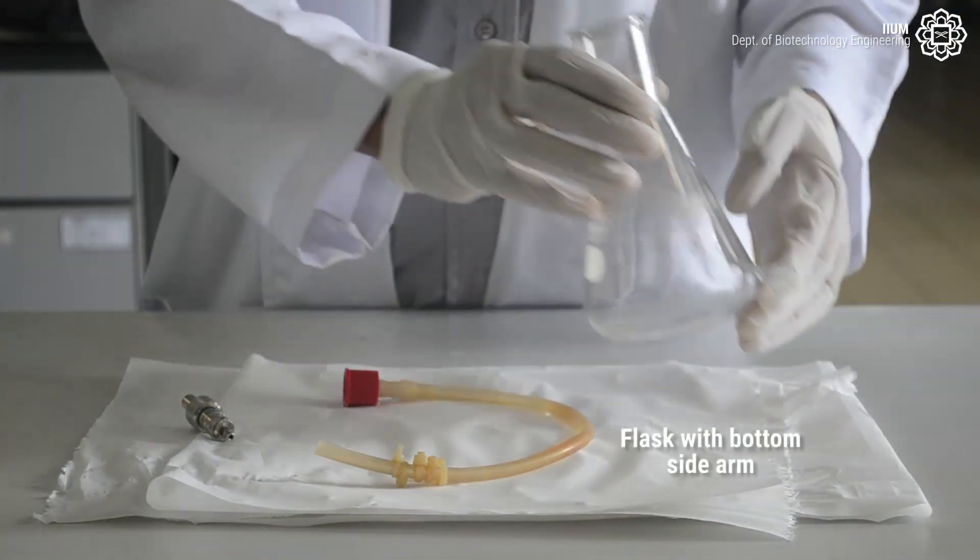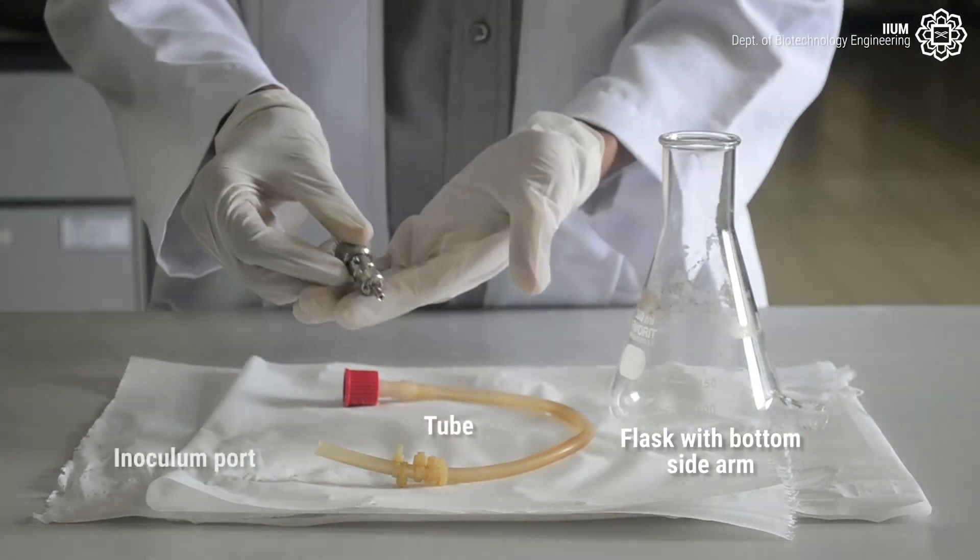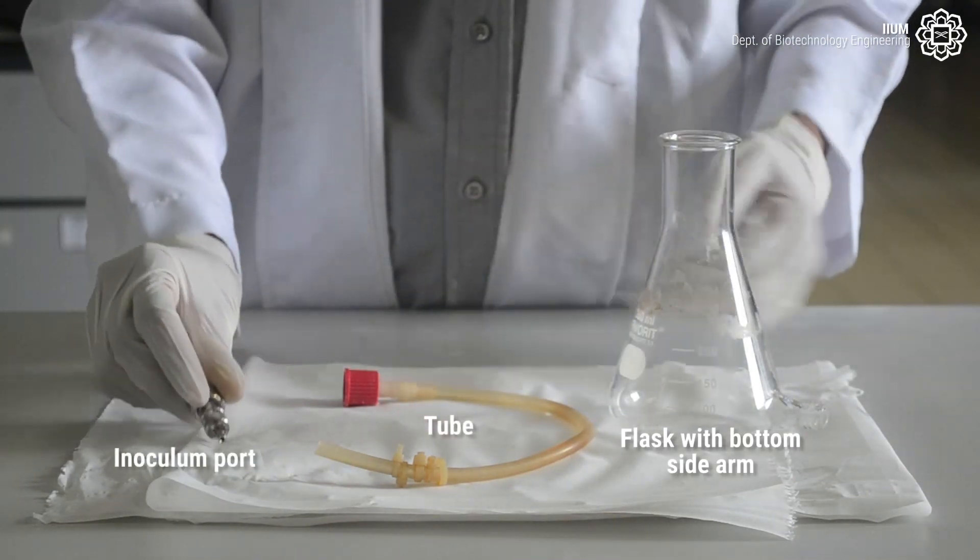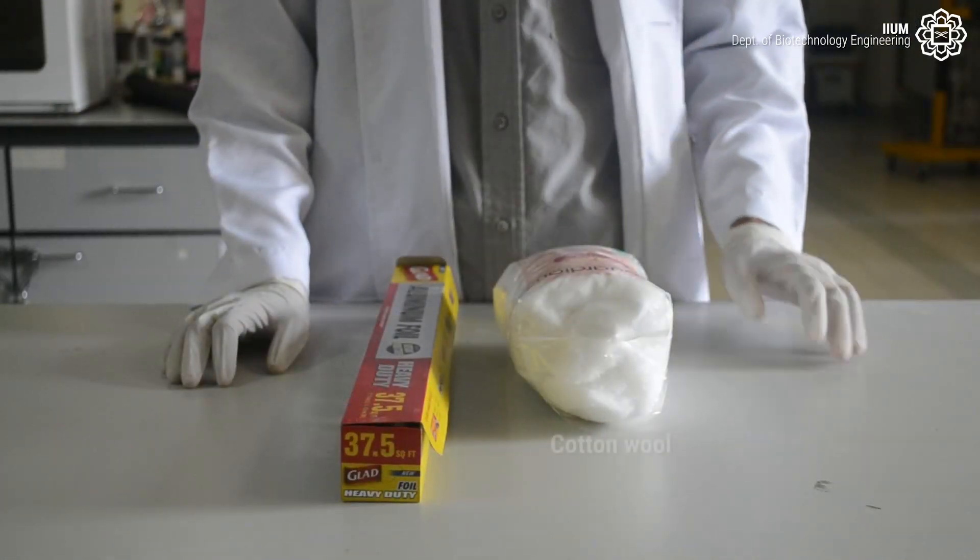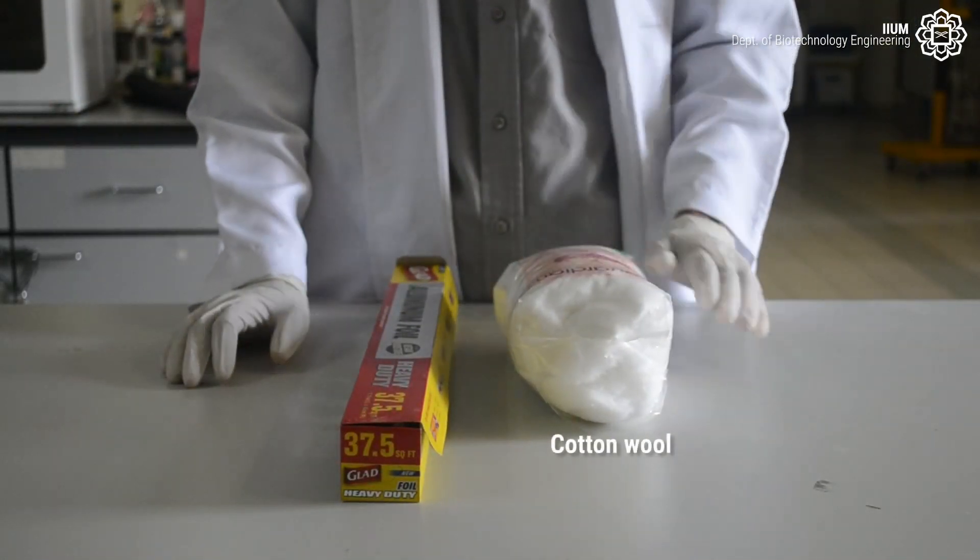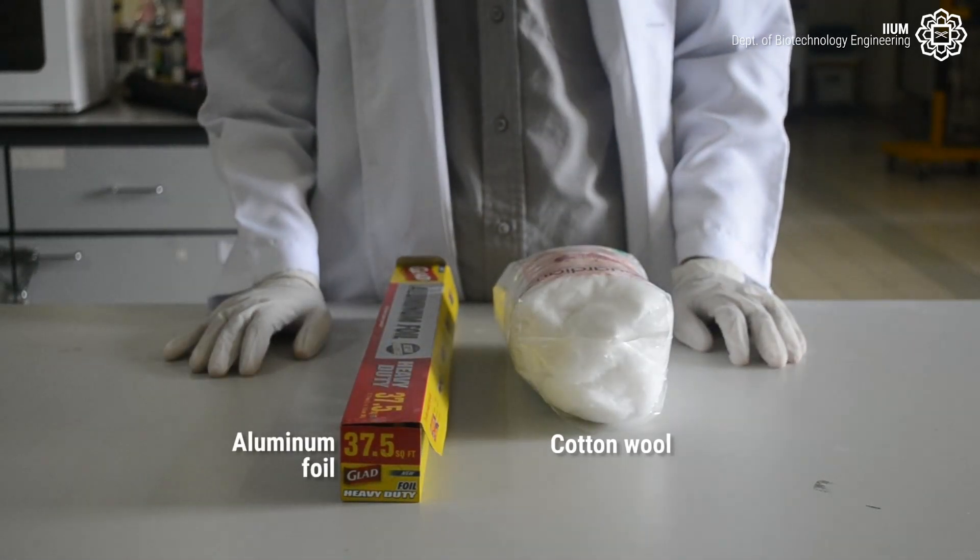Then we need a flask with bottom sidearm, tube, and inoculum port. After that, we need cotton wool and aluminum foil for covering some parts of the photobioreactor and the flask.